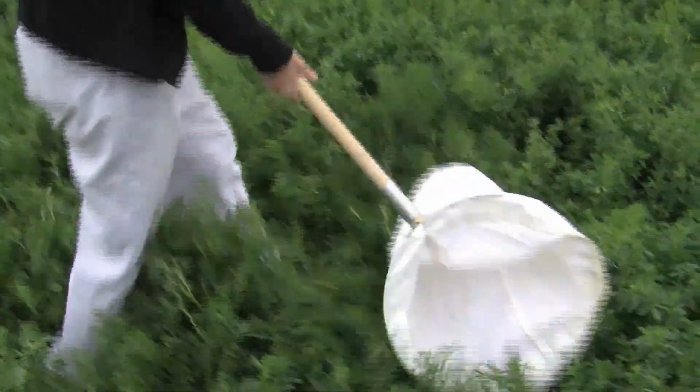For the sweep method, a large insect net is used to physically collect specimens by sweeping the air or against any shrubbery. The baiting method uses a mixture of tuna and peanut butter to create a bait, which will emit a pungent odor that will attract any specimens. For the temporary storage of all these specimens, a Ziploc bag can be used.